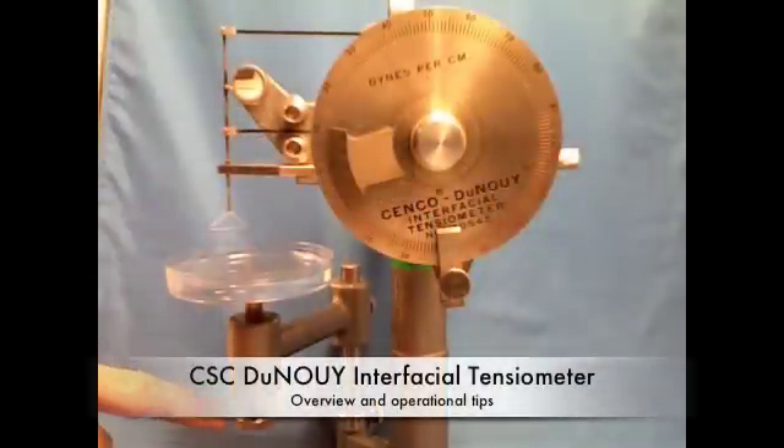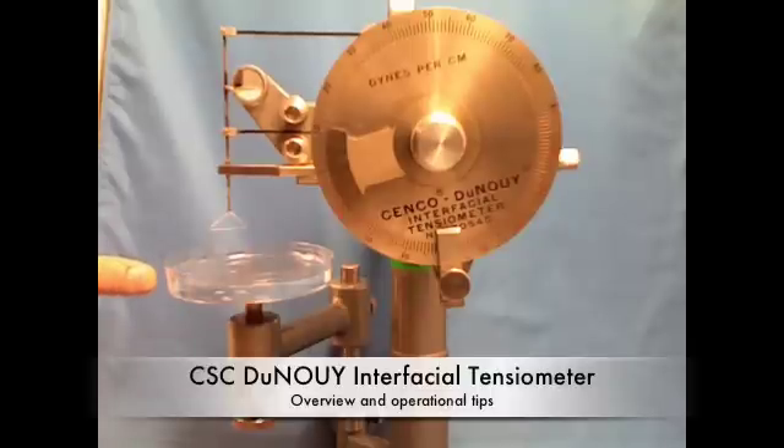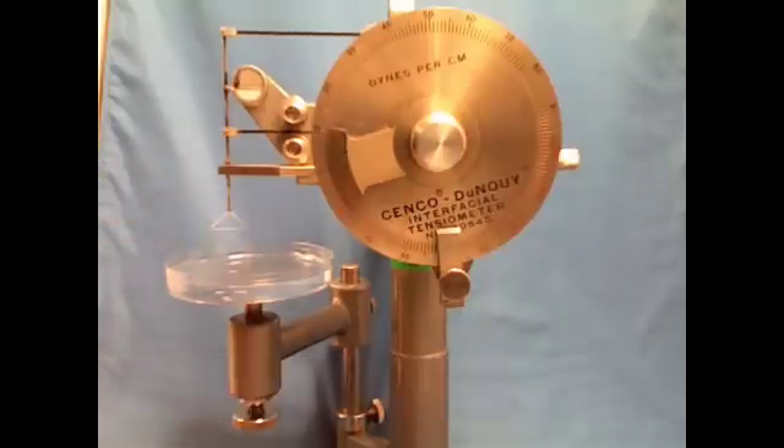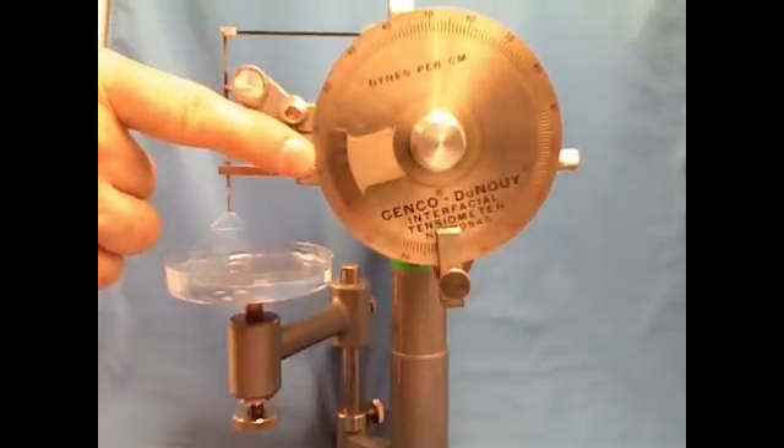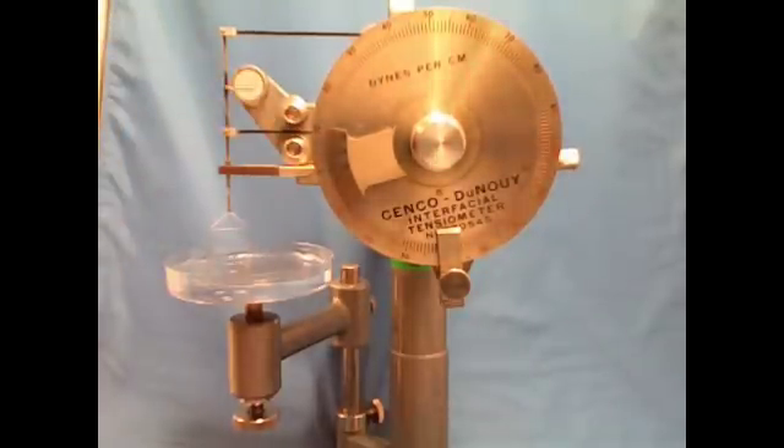Important features of the Denoy Tensiometer include the screw for lowering the platform, the petri dish for the sample, the Denoy ring, the mirror for leveling, the dial for reading off the dines per centimeter, and the dial for adjusting the dines per centimeter.